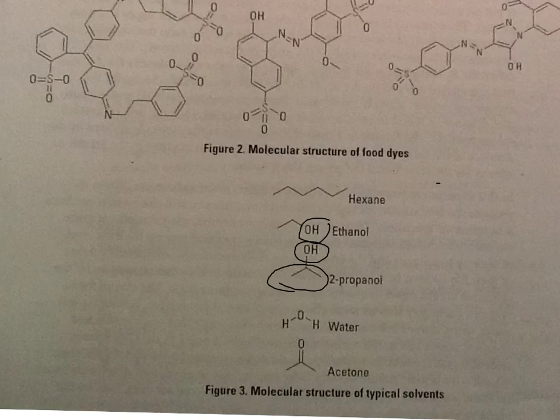It would stick in the way a little bit more versus this kind of like a tail. And because these can rotate, this is going to be able to fit closer to certain molecules than what this is. This 2-propanol here, this hydrocarbon group, is going to be more bulky.